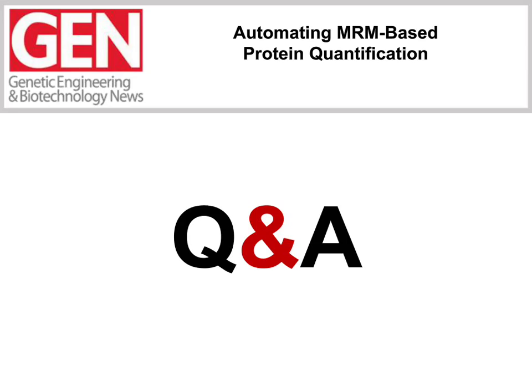Okay, thank you. Well, that's a good question. Normally, it's best to add internal standard as early in the sample preparation workflow as possible to compensate for any variation during the sample preparation. Hence, the addition of the SIS mix prior to tryptic digestion would seem to be the preferred choice.